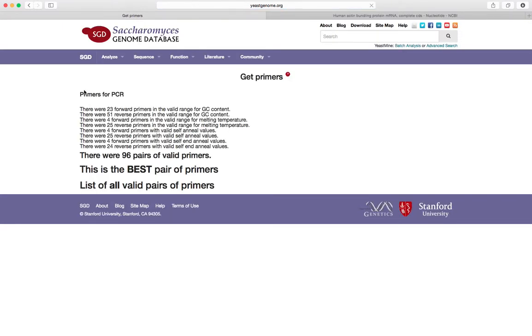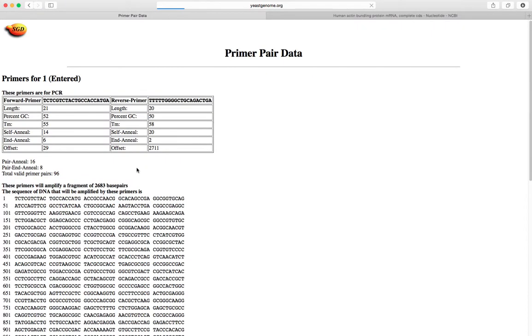The results page will give you statistics on the primers WebPrimer found for you. It will give you how many primer pairs were found, as well as links to the best pair of primers and a list of all of the valid primers. We will click on the link to the best primers.